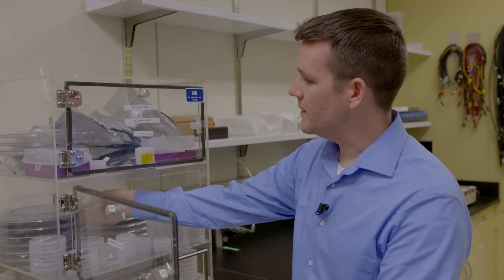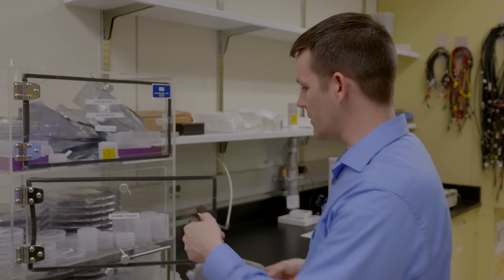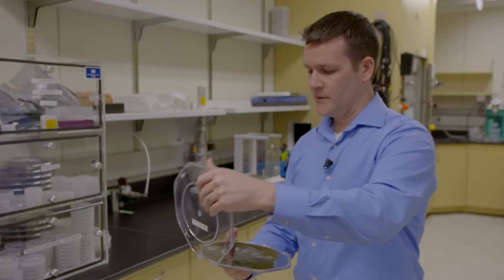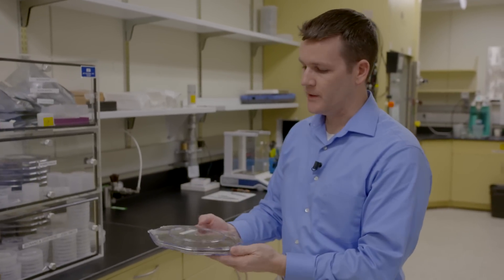This is our bio nano lab. Essentially what we do here is microfluidics. Some of the chips that we're making here for microfluidics, specifically for the purpose of sorting, are essentially a set of pillar arrays.